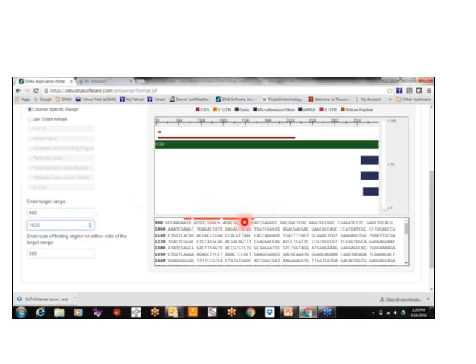In our procedure, we need to design it so it has little or no affinity for specific sequences, so we need to highlight these, so the probe that we are designing is not targeting specific sequences.